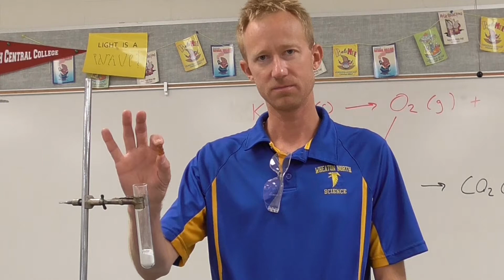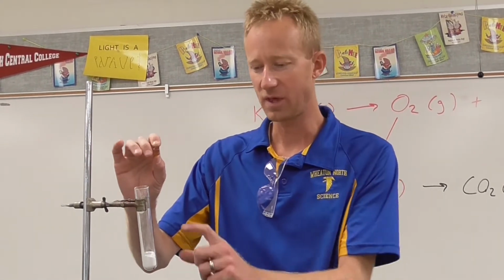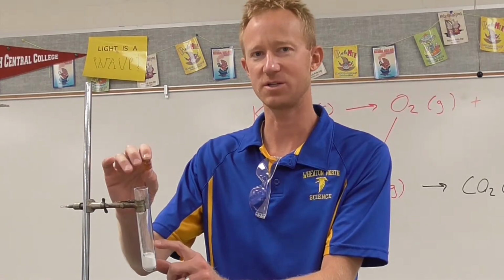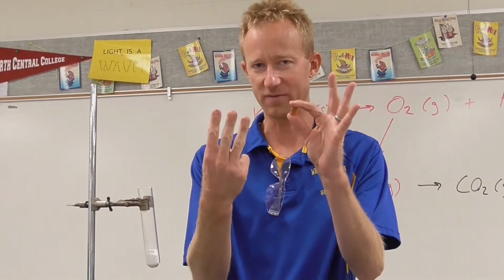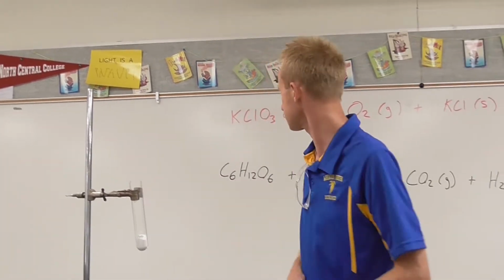We have sugar, which is the gummy bear. That's what will be combusted, combining with oxygen that we generate from the test tube. It will be hot, we'll have something to burn, and we'll have the oxygen source. So here are the reactions that will guide us.